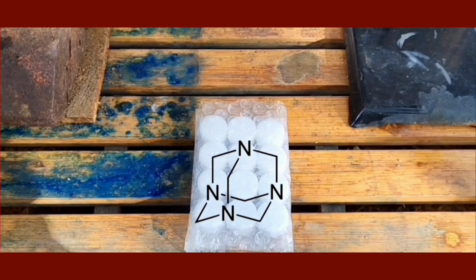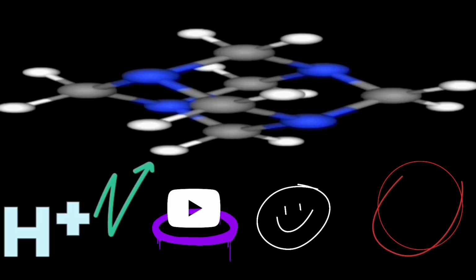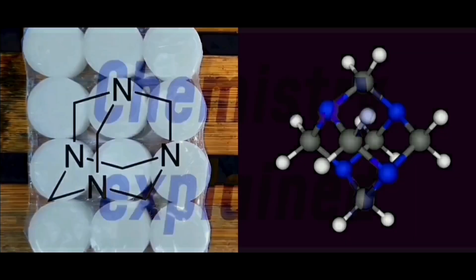Today, hydrolysis and the polycyclic chemistry.